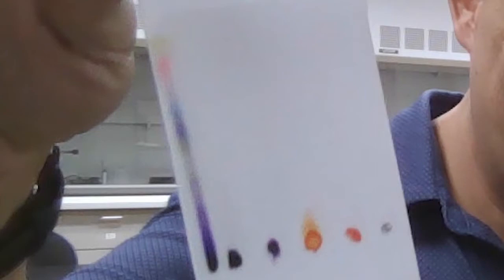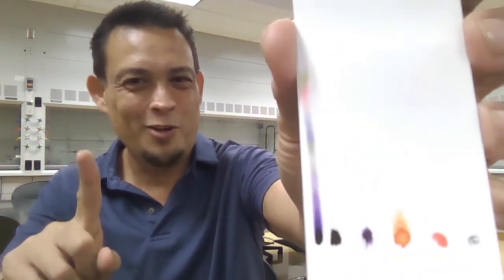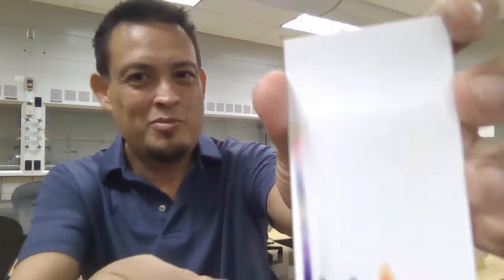So essentially, anything that doesn't move on this plate can be used for your spotting, your line drawing. But remember, we're changing the solvent. If you were to put this plate in the same solvent we're using in today's experiment, other ones might move, or this one might move differently. It all depends on the solvent that you're using.